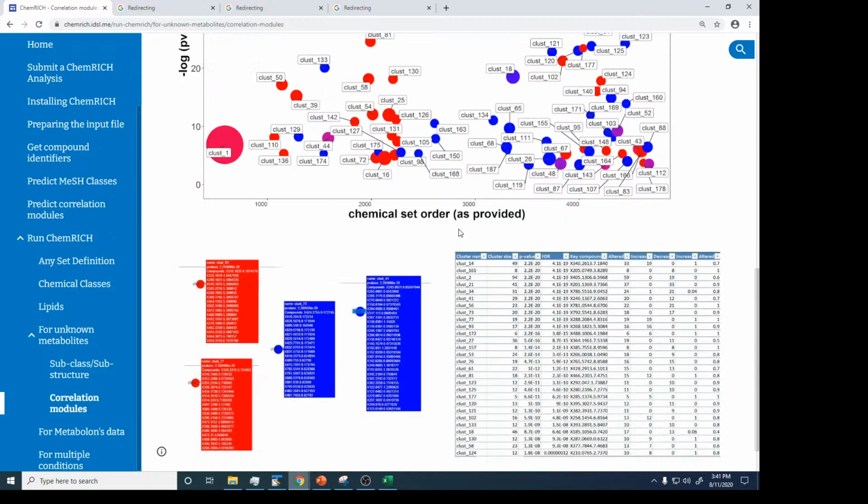Now still, these unknowns need further experiments. What is the similarity of all the features in this cluster, that why they correlate? Do they belong to a similar chemical class, or a similar pathway, or a similar origin, and so on? These are the questions that we could now ask of this ranked set matrix.